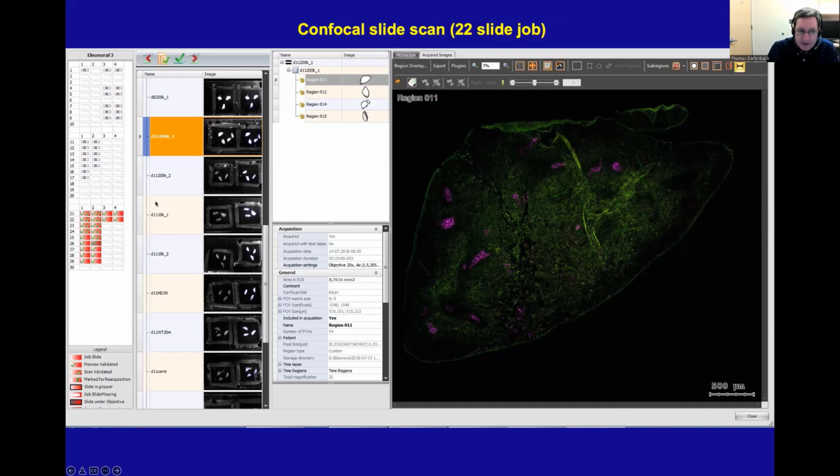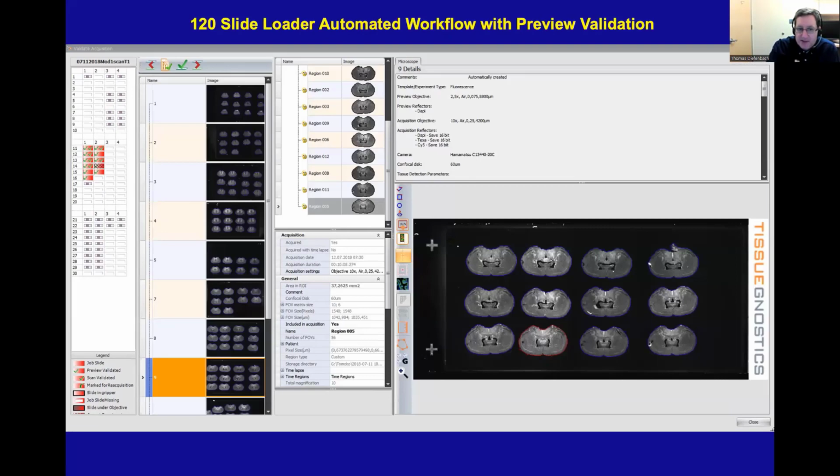To the right of the slide map, we can see examples of slide previews. We usually would have 6 to 10 lymph node sections per slide. And then on the right, you can see just one of those images, a confocal image taken of that particular lymph node. When it does the Z-stacks, they aren't usually too big, but you can step through the stacks. You could use software to look at them in 3D if you like, but of course we're only looking at cell populations in 2D, so the point is just to get some of the depth as well in confocal.